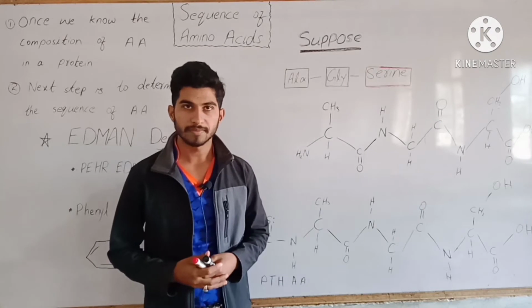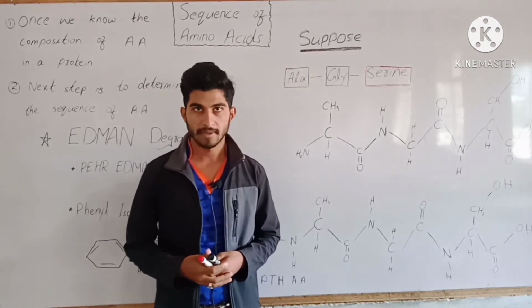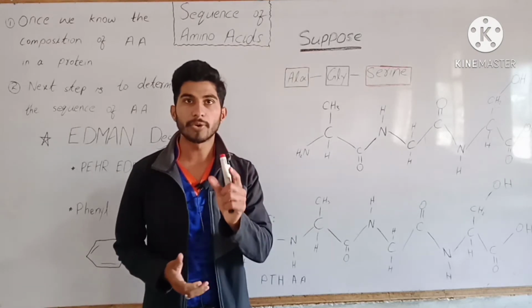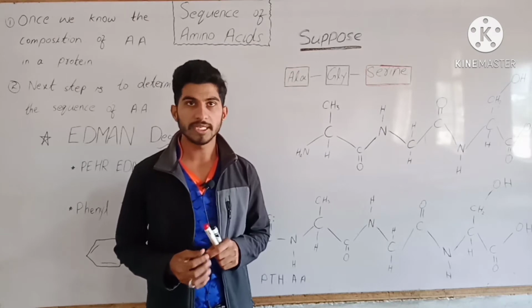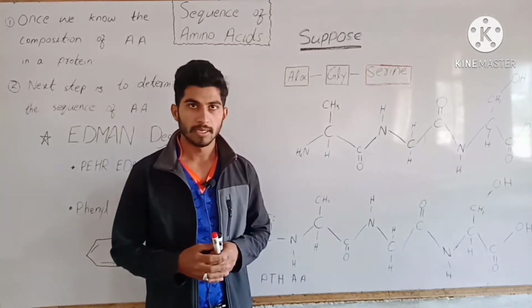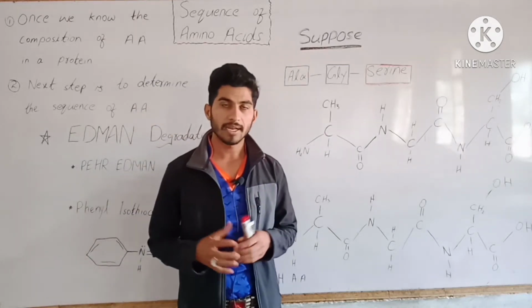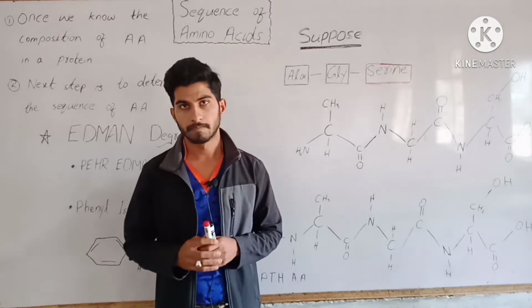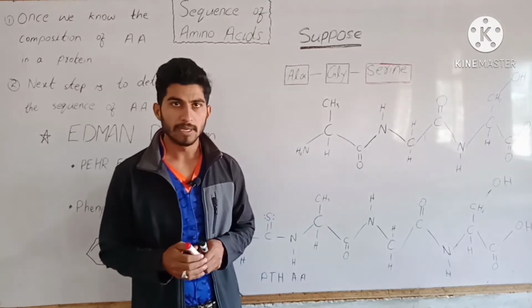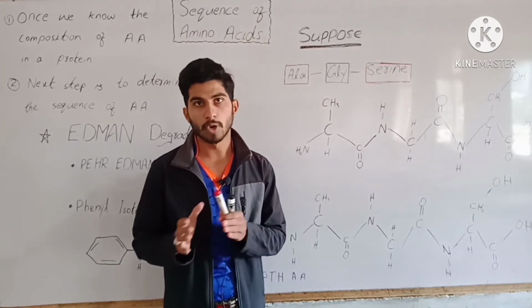Assalamu alaikum. Previously, we have discussed that if we purify a protein from the body and we want to study that protein, then the first thing we do is determine the composition of amino acids in that protein. The very next step is to determine the sequence of amino acids in that polypeptide chain.